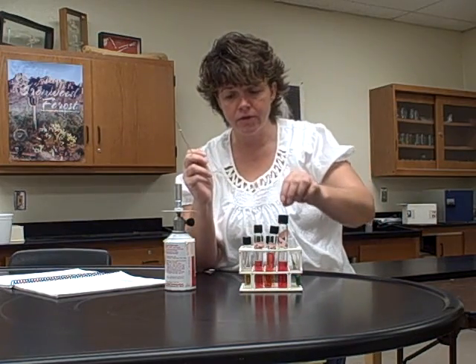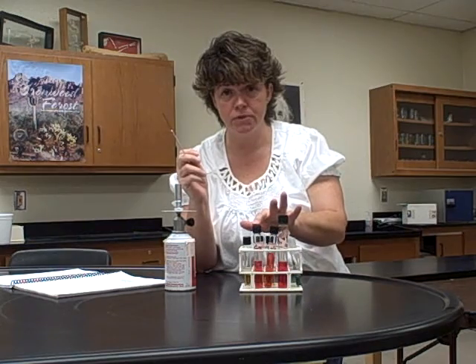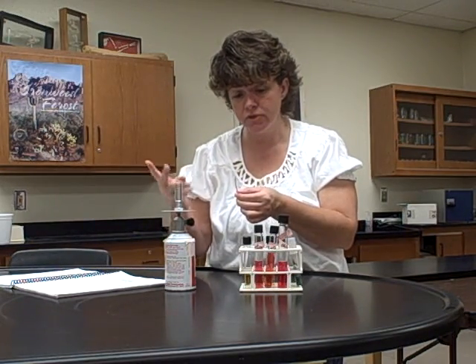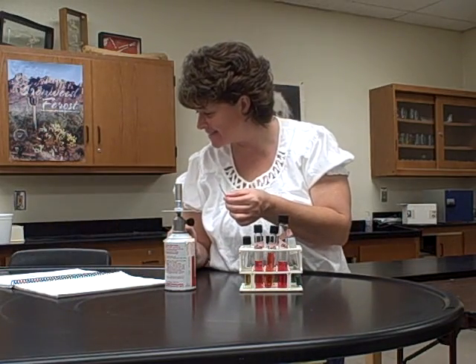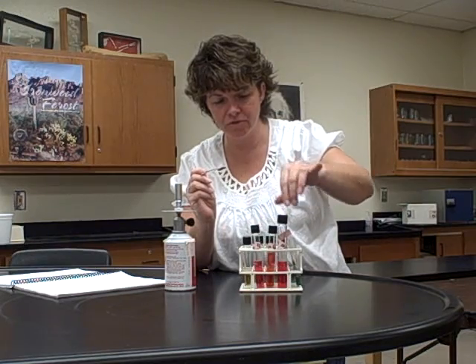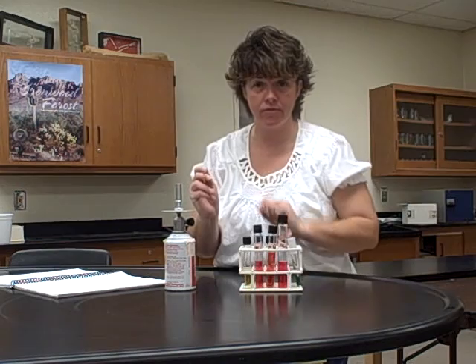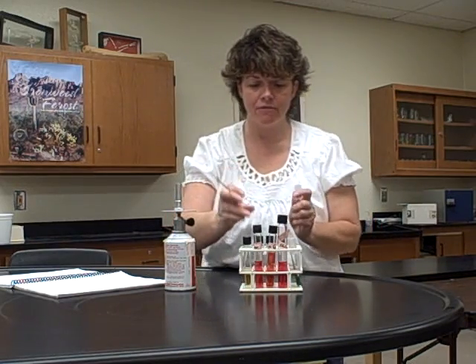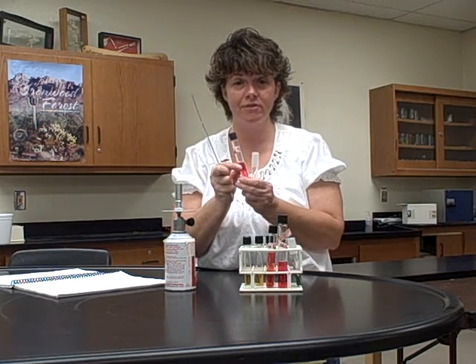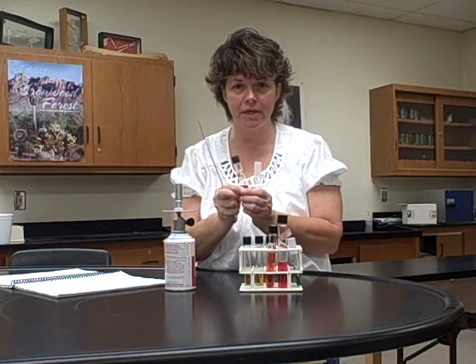Okay, now you're going to put the bacteria that you were assigned into all 3 of the tubes. Okay, the different sugars will be lactose, sucrose, and glucose. Okay, so we have lactose, sucrose, and glucose. Okay, so we're going to put our bacteria into all 3 of those. So I'm going to take the first 2, and just make sure you have, before you do any of this, you would have labeled it with your name and the name of the bacteria. Don't forget the labeling part.